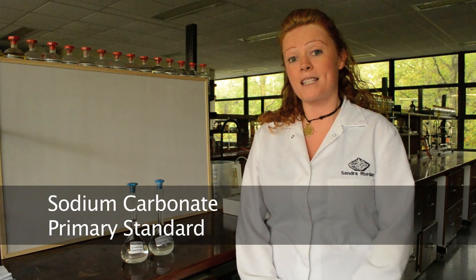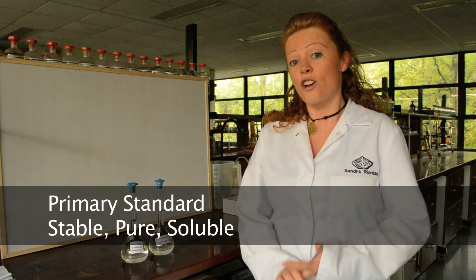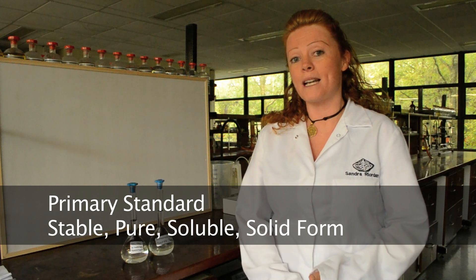A standard solution is a solution of precisely known concentration. A primary standard is a substance that can be found in a stable, pure, and soluble solid form so that it can be accurately weighed out and dissolved in water to make a solution of known concentration.